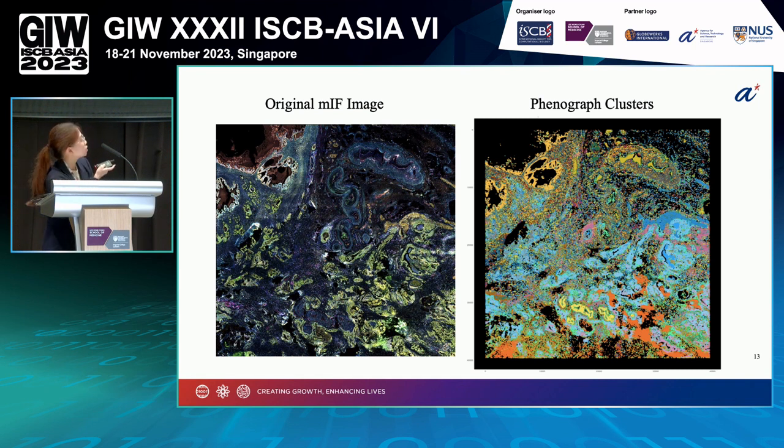And then if you focus on this cluster 10 right here in mid blue, these correspond to this group of cells here. Because of our analysis pipeline, we managed to identify that this cluster of cells are NK cells as well as monocytes.